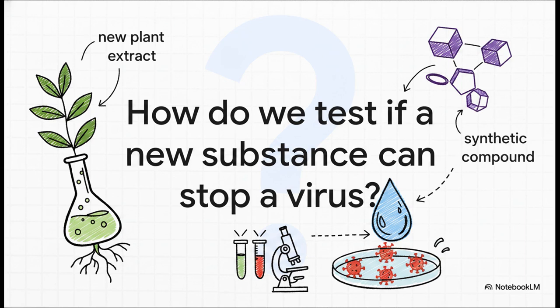Let's say you found a new compound, maybe from a plant deep in the rainforest. You've got a hunch it could fight off a nasty virus, but how do you actually prove it? You can't just jump to human trials, right? Well, this procedure is pretty much the very first step to finding out if you're onto something big.